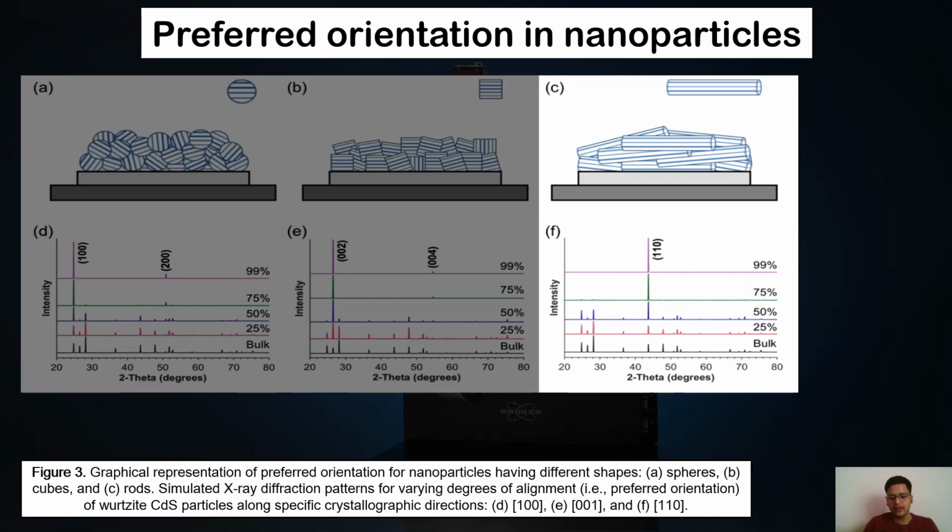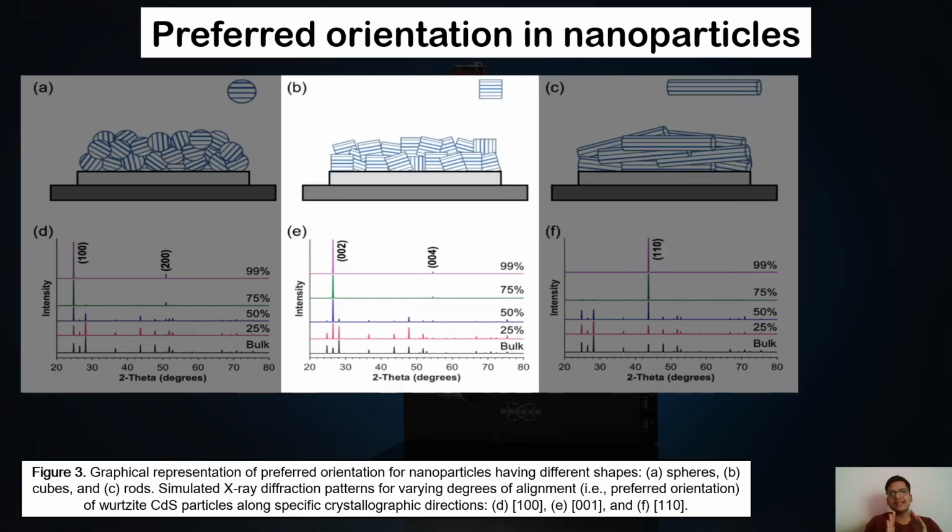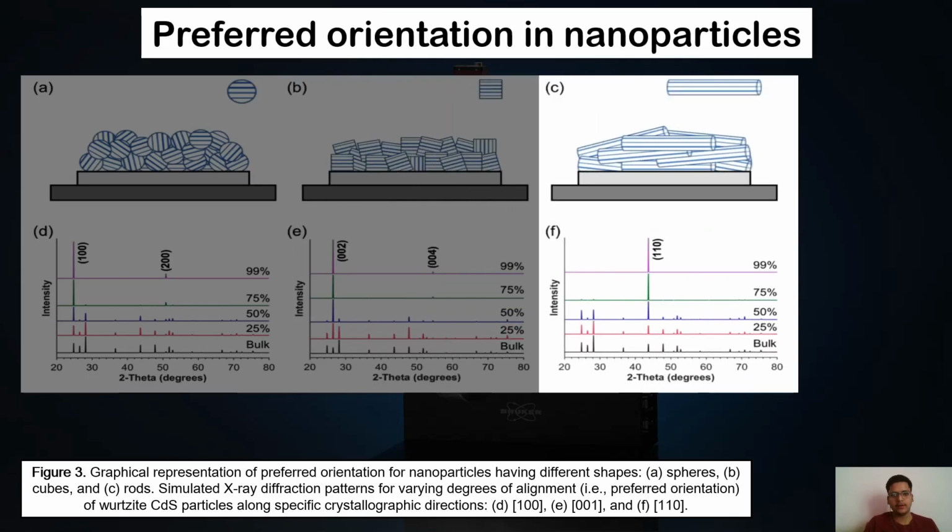Similarly, in that way, the randomization is much more in the spherical one, but the cube one, as you can see over here, will have a certain face, right? So a cube will stack upon a certain face, just like in the Tetris game, in which we try to place the bricks, right?